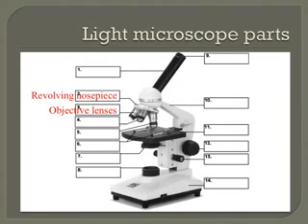On our microscopes, the shortest lens is referred to as the scanning lens and is colored red. The scanning objective lens magnifies whatever you're looking at 4 times. If you take into consideration the 10 times magnification from the eyepiece, there's a total magnification of 40 times. You'll always want to start looking at things underneath the microscope using the scanning power objective lens, as it makes it easier to find what you're looking for.